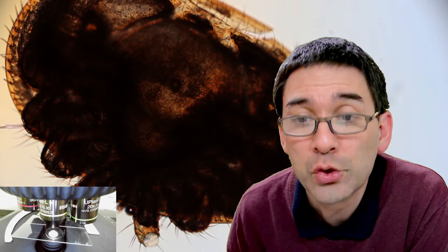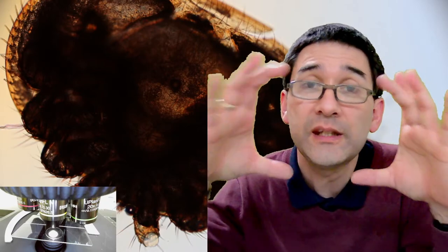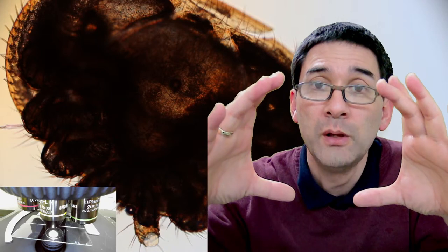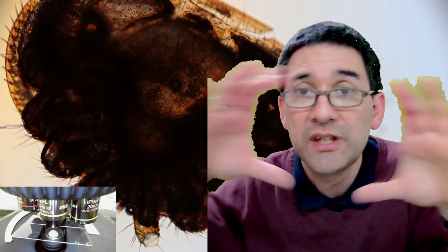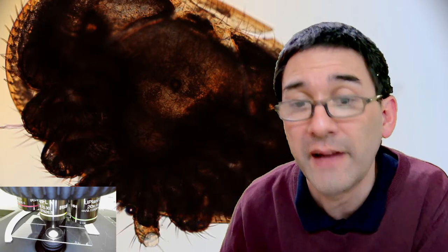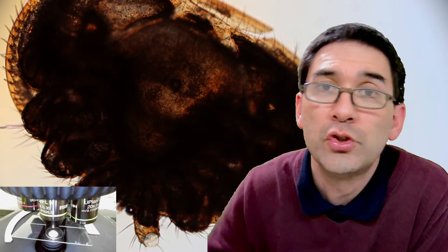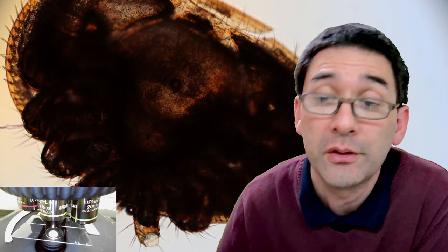Would an optical zoom make a difference? Yes, I think an optical zoom is very good because it allows you to zoom in, and then you do not see the image in such a circle anymore, but you have it more filled in. Without a zoom, you might see the image in a circle when you film through the eyepiece. With an optical zoom, you might not see the circle as much, so it would probably be an advantage. Digital zoom, no, because you don't increase the resolution. You might as well crop the image on a computer.